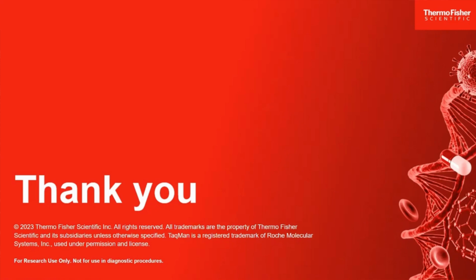Thank you, Christy. So there are two layers, one could say, of working when it comes to custom dye calibration. First of all, different real-time PCR instruments will have what we call standard dyes that the instrument is calibrated for routinely. But if it's a dye that's not part of that standard dye list, we call that a custom dye. So first of all, we have the custom dye calibration process. And for that to be successful, all we need is a reasonable amount of dye signal. That guidance is provided in the user bulletin, maintenance guide, things like that. That's usually not an issue.